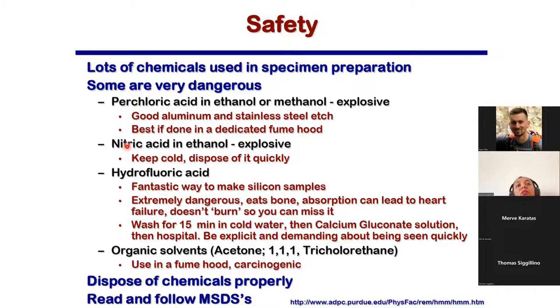Another thing we use is nitric acid in ethanol. The only thing is that it's also very explosive. So you have to take care that you keep it cold and dispose of it very quickly. Do not be in touch with it. Other kinds of acids that we use are hydrofluoric acid and organic solvents.